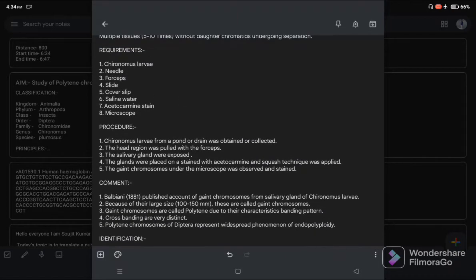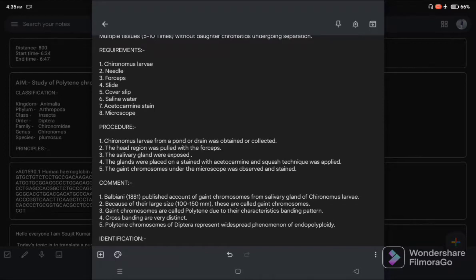For the procedure: first, Chironomus larvae from a pond or drain are collected. Then the head region is pulled with forceps. The salivary gland is located near the head region, and the polytene chromosomes are present within the salivary gland, so exposing the salivary gland is necessary.